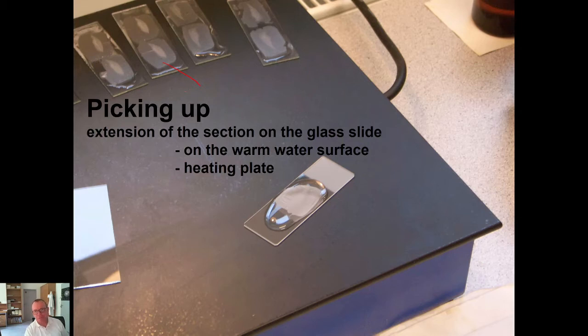Of course, it isn't the end of the procedure. We now have a tissue on glass, but it is colorless, with the exception of some natural colors like pigments, and it is still embedded in paraffin, and this paraffin, everywhere around and also in the tissue, is a material which now has to be removed, because when we want to stain our section, we have to remove the paraffin as a hydrophobic material, because the staining dyes are always water solutions, sometimes alcohol solutions, but they never mix with paraffin.